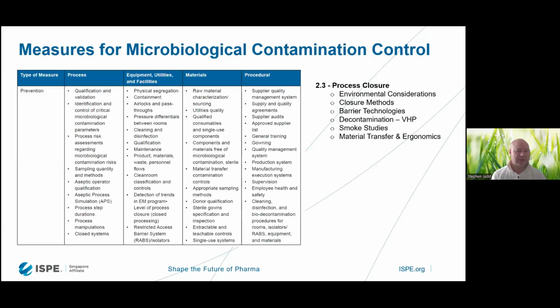Contamination control is critical, not least because you're talking about an aseptic manufacturing process for a drug which is not sterile filtered and not terminally sterilized, and therefore you are looking at aseptic technique in high-grade environments for end-to-end manufacturing.